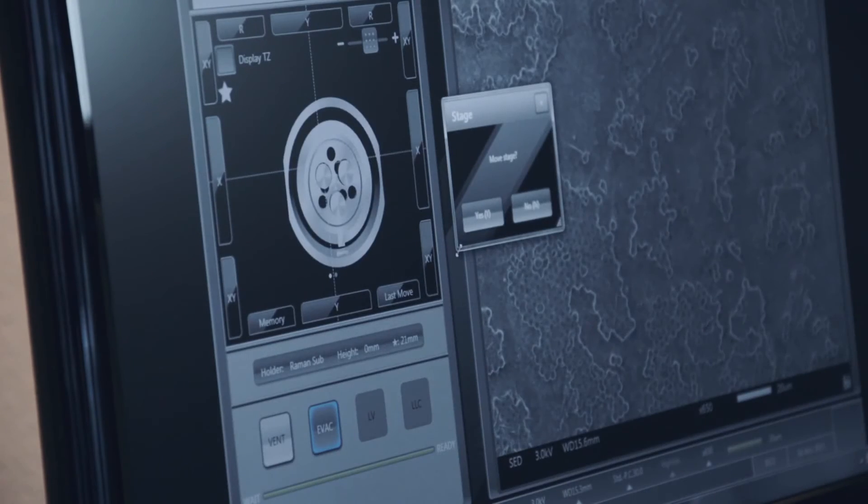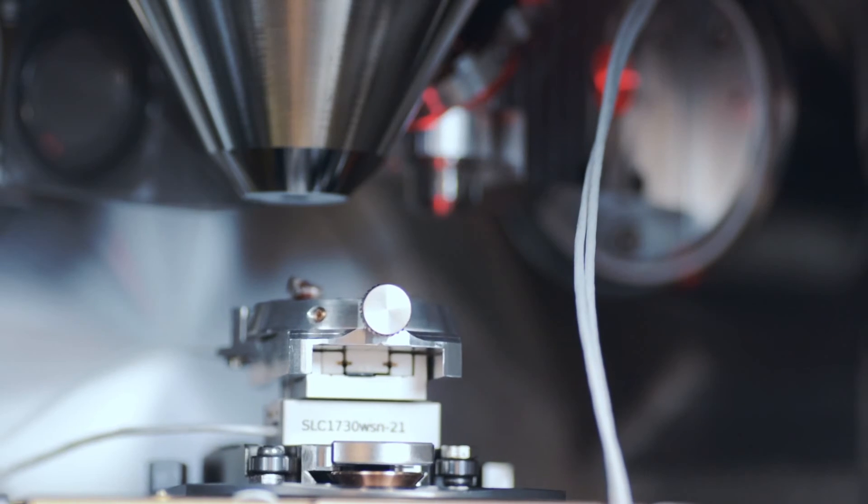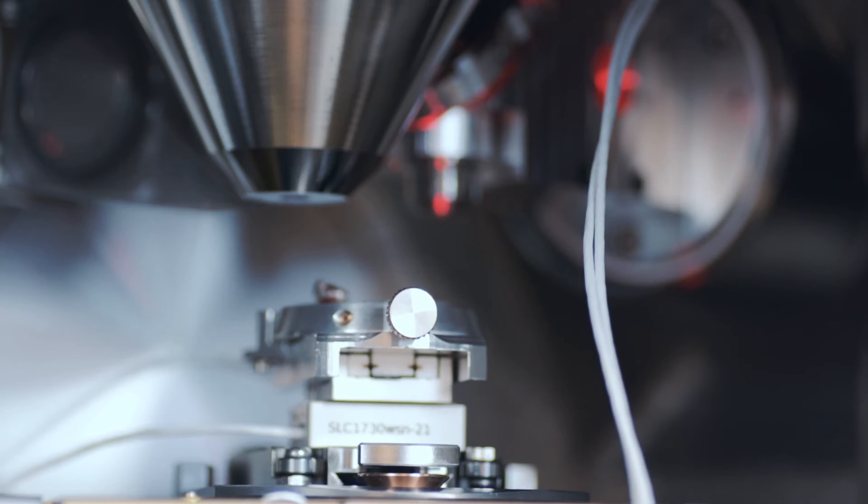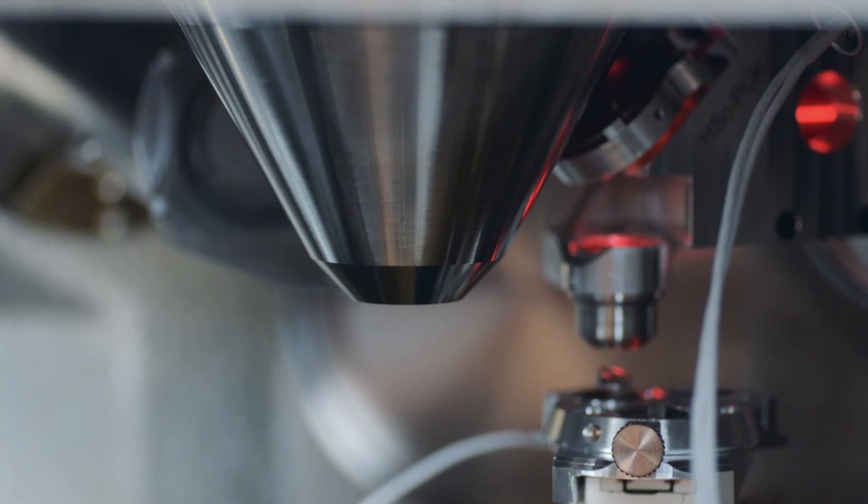The sample is displaced with the main stage from the scanning electron microscope to the Raman spectrometer position. The Raman objective is, manually or automatically, adjusted in height to obtain an optimal focus and efficient Raman light collection.